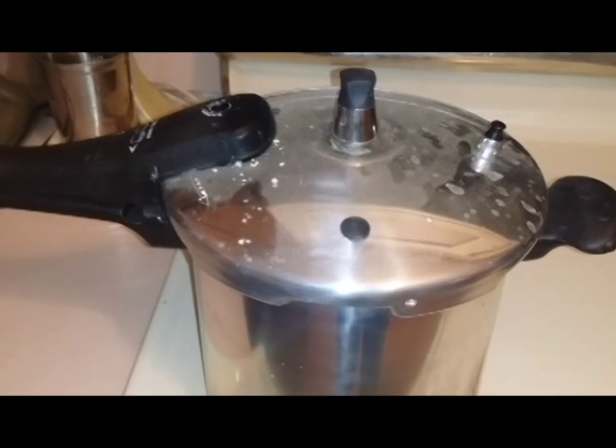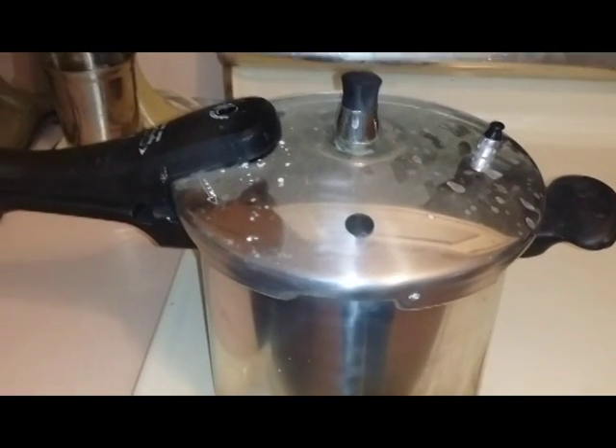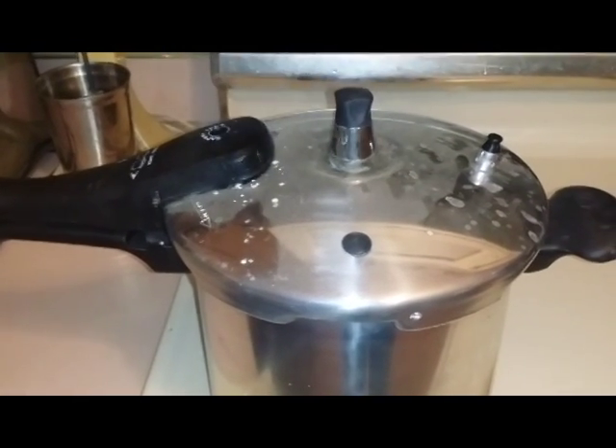Do bear in mind that it takes a good 10 minutes on my stove for the pressure cooker to get to this point, so you do need to be a little patient.